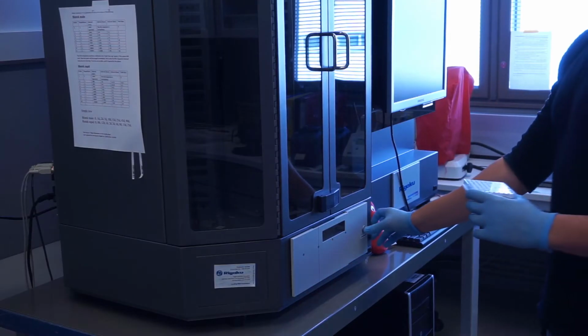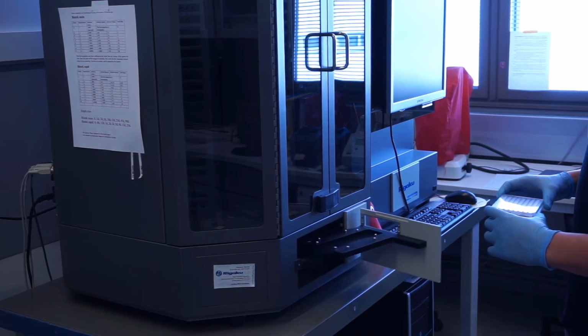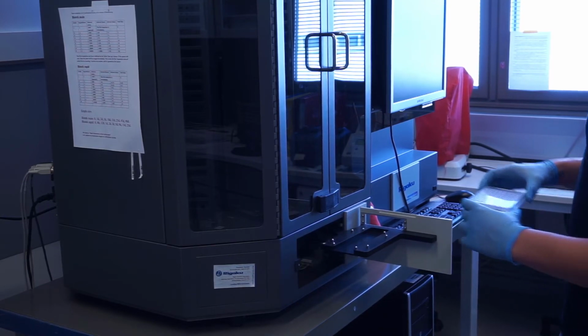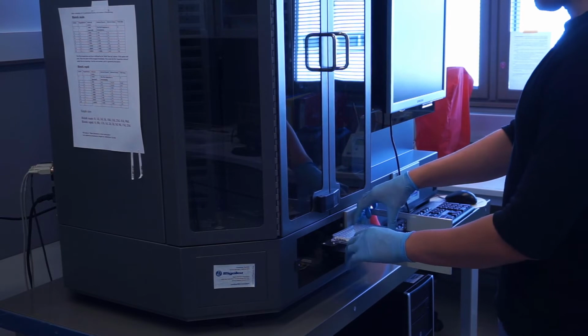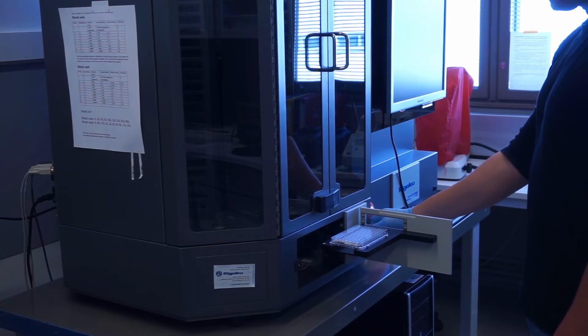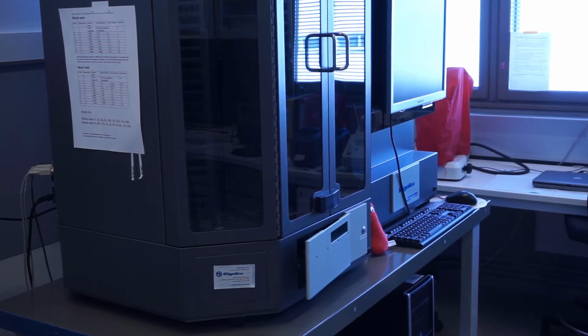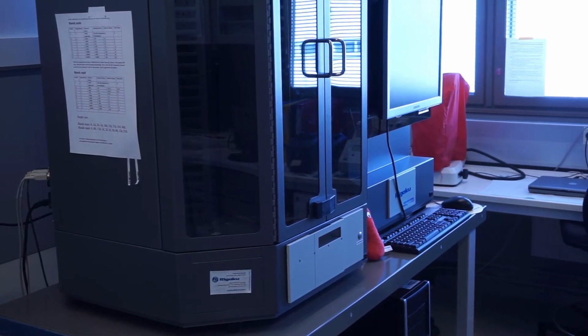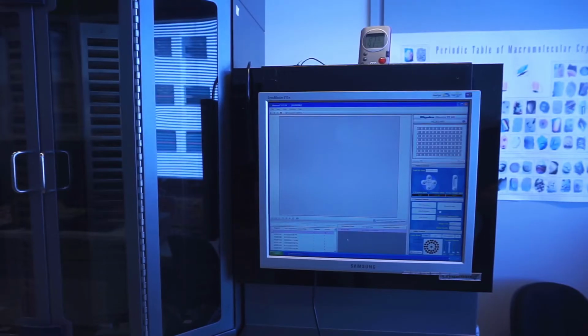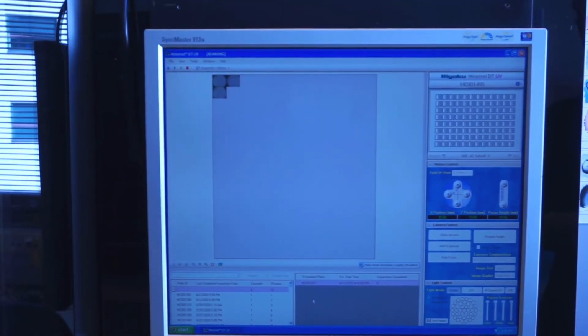After the plate is ready, press the imager opening button and wait until the drawer is open. Load the plate in between the metal stoppers, ABC side facing left. Press the button to close. Then the laser will come. Check the barcode, take the plate and store it. All imaging will be done automatically.